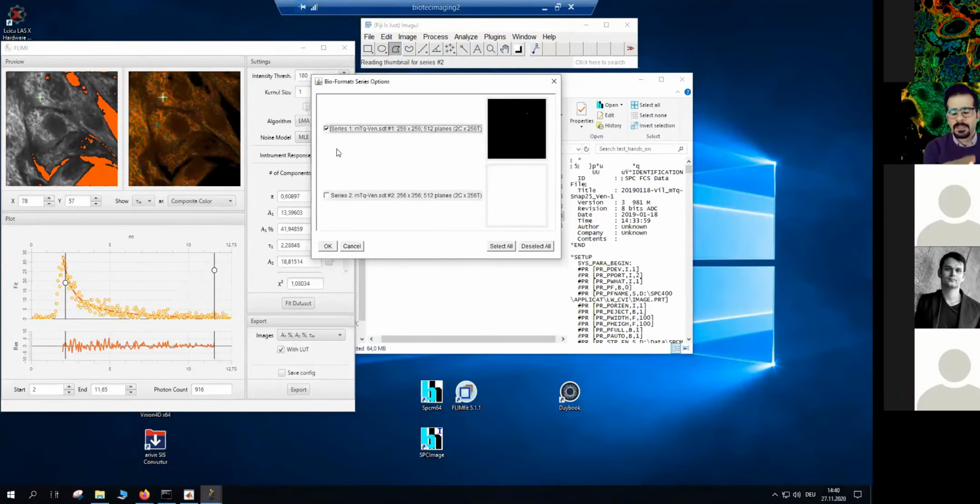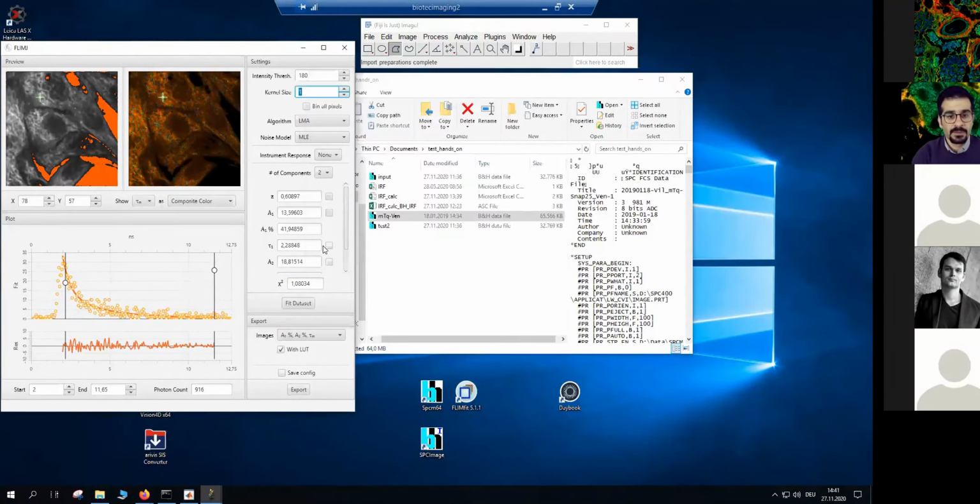not the Leica system that we explained yesterday. We have another FLIM system, which is a Becker and Hickl system on a Zeiss confocal microscope. So there we have 2 detectors and 2 single photon counting modules. So it's asking which one of these 2 series you would like to import. If I don't know which one, I just say okay, both of them. Let's see how long it takes to open this file. What we are opening now are 2 images, each of them with 2 channels.